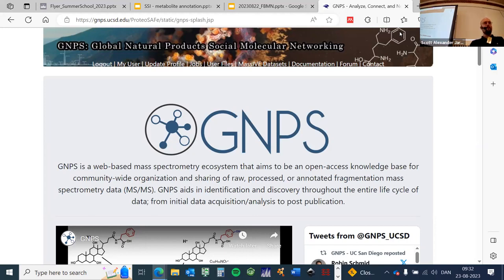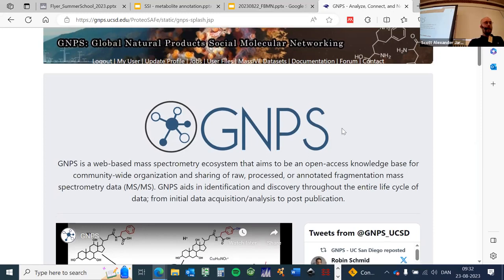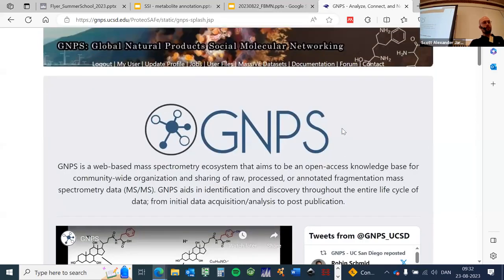So hopefully everyone is connected to the internet, not having problems. And let's just dive right into it. So everyone should have hopefully created at this point now a GNPS user and information. So navigate to the GNPS homepage, and we're going to walk through how we run the data.